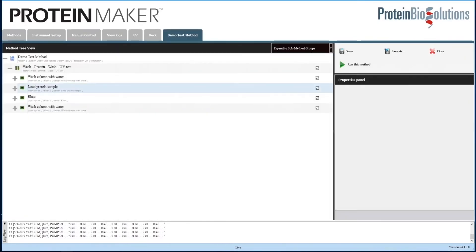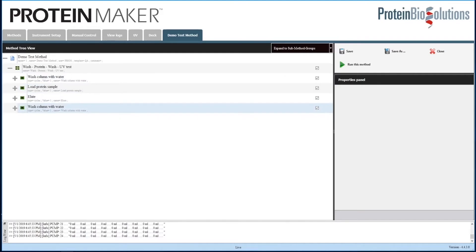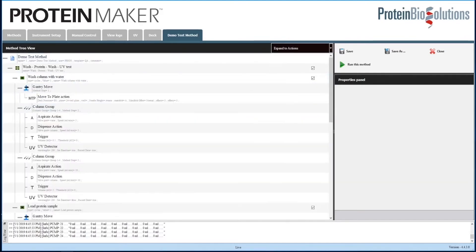So we are going to open this method. It's a simple method in which we will wash the column, load the protein, and then elute, as a demonstration of how the control software works. So we will expand the method so that we can see all of the steps and details of the method, and click Run to start the method.